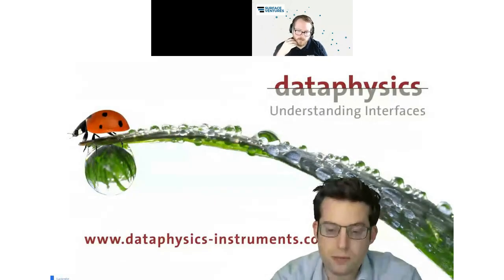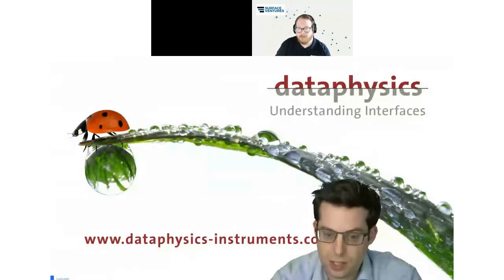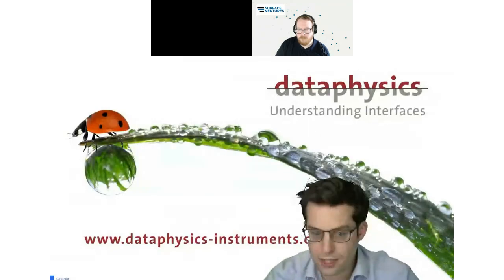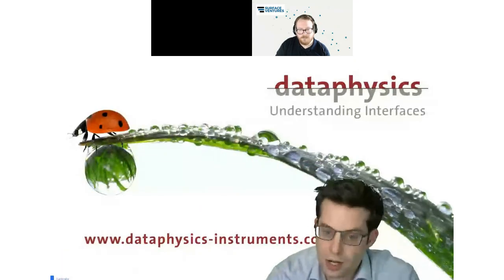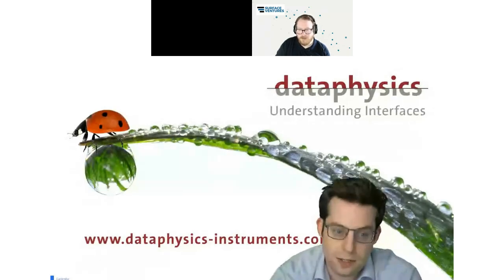What we can do is determine a work of adhesion through the contact angles, for example. So this may at least teach you something. But in the classical experiment, you put a drop on it and pull it off again, the drop will stay on the surface, and then you get rather the cohesion when you rip the drop apart in the middle, but not a pure adhesion. So I would probably go for work of adhesion through contact angle and surface free energy analysis.